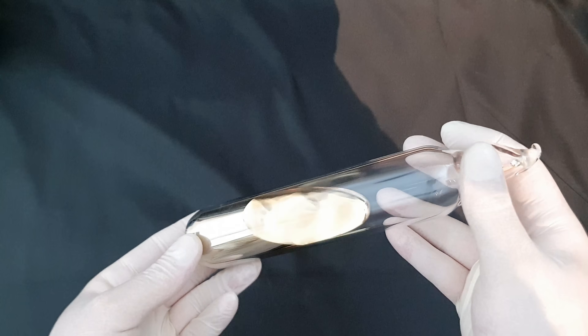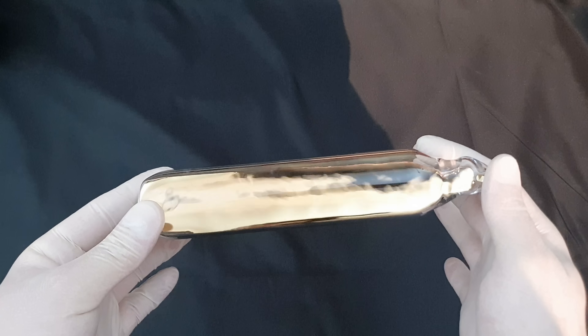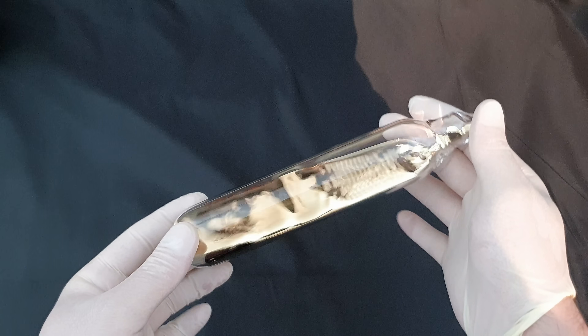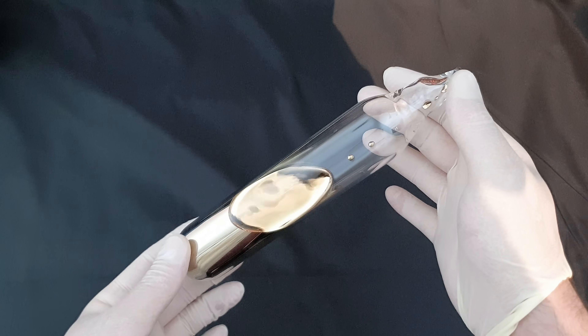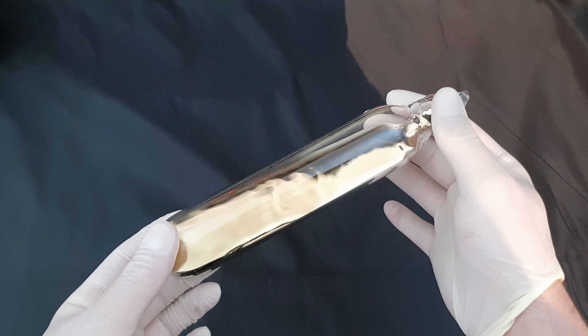I know that it's not a competition, but if it were, I think I would have won. What I'm holding in my hands is the largest vial of cesium ever shown on video. This golden metal is the most reactive metal on earth. It burns when it's exposed to air and explodes in contact with water.